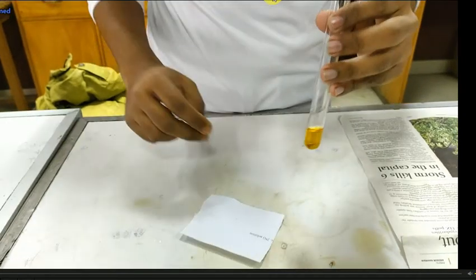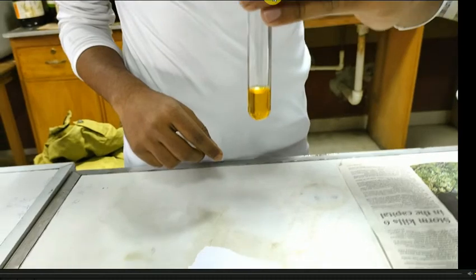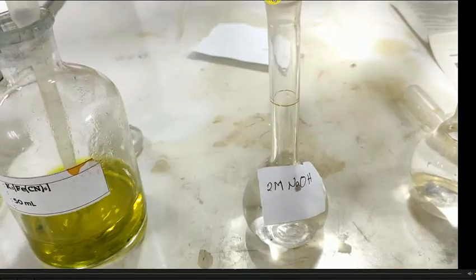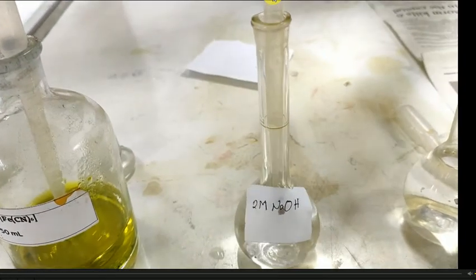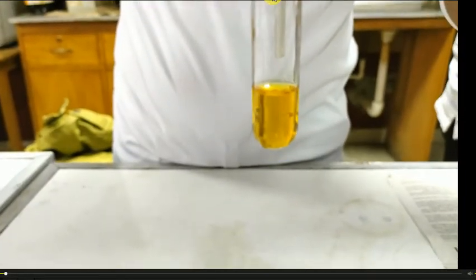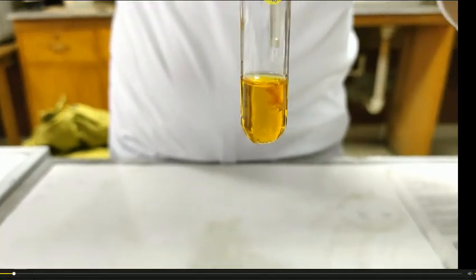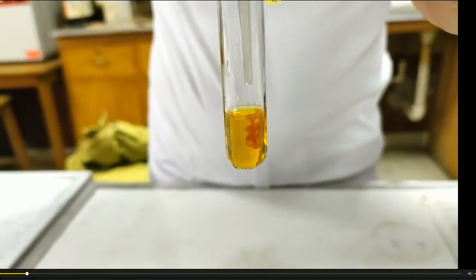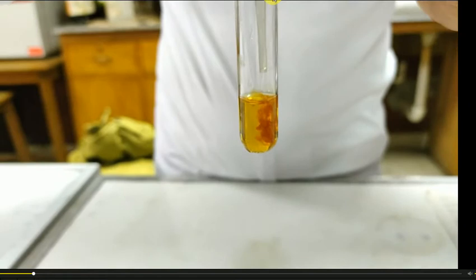In 2 ml sample solution, now we are going to test for the ferric ion. Now we are going to add just 0.5 ml 2M sodium hydroxide into this sample solution. This will produce a light brownish gelatinous PPT. This is a light brownish gelatinous PPT, and the PPT is insoluble in excess amount of alkali.